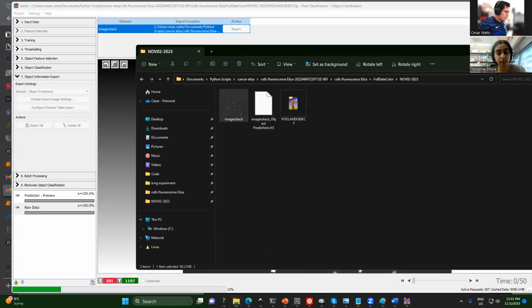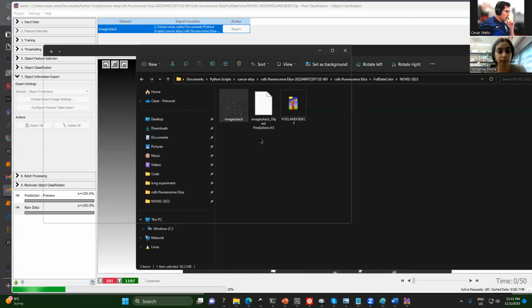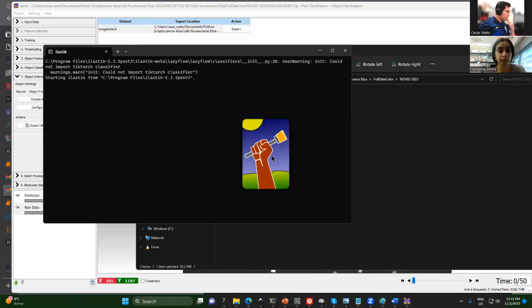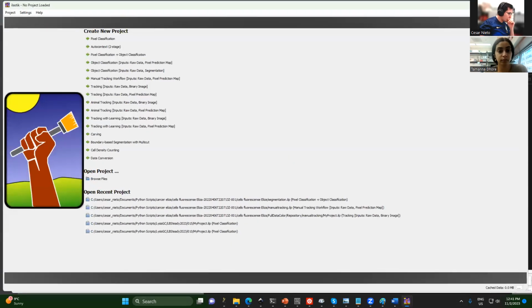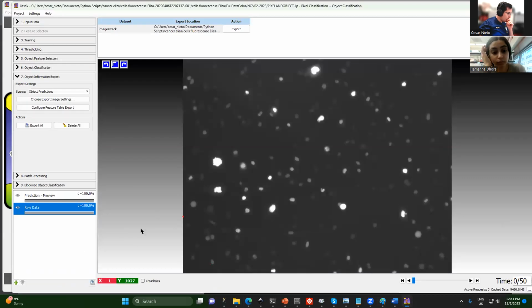So meanwhile we can start opening the tracking file, the tracking platform. So you open a new file. Everything seems to finish, no? Looks fine.